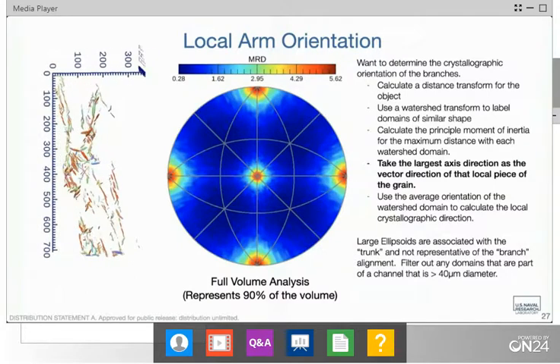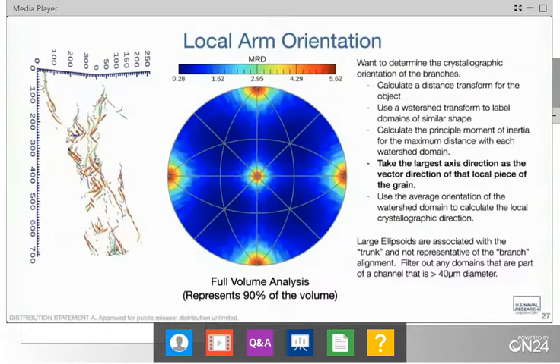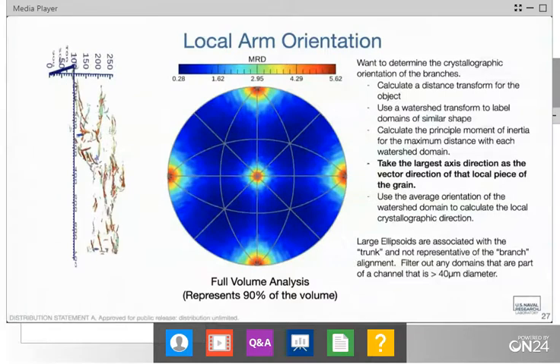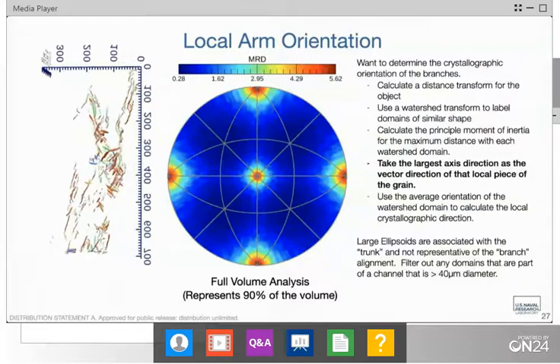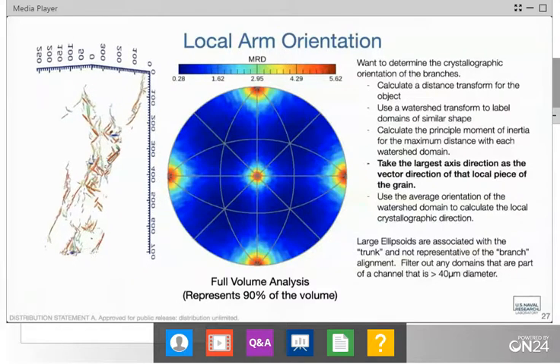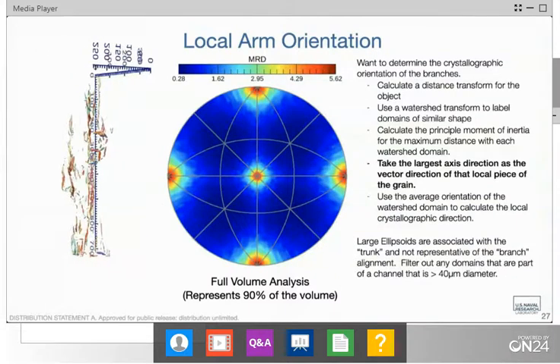They would be removed from our sections, and we'd have to come back and basically place them back in. So we got by without having hard fiducials on every one of our sections, but they were handy to have there for depth removal, just to make sure that we were on track, as well as for some of the global alignments. It was handy to have that as a marker.